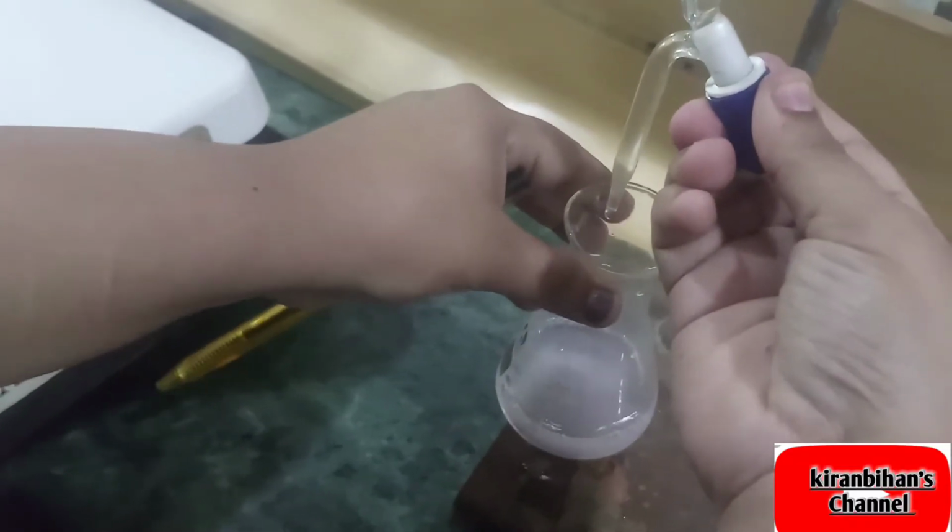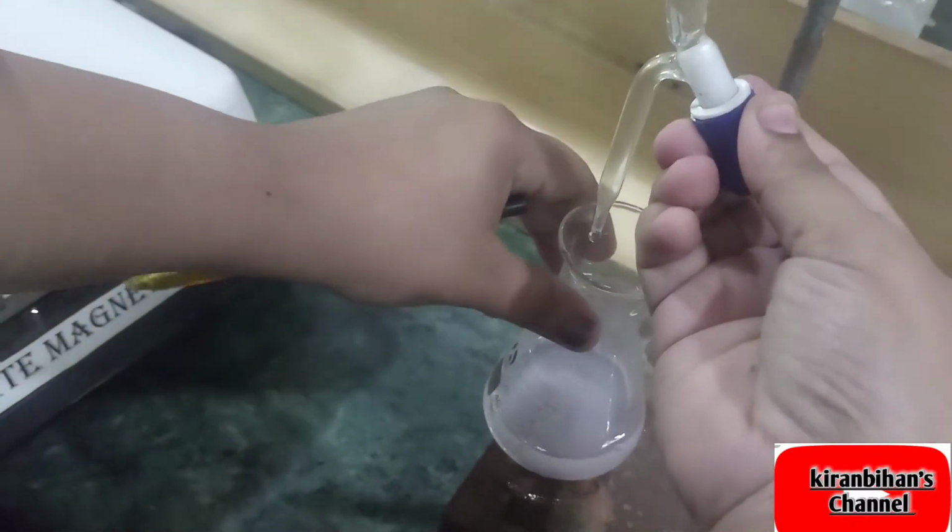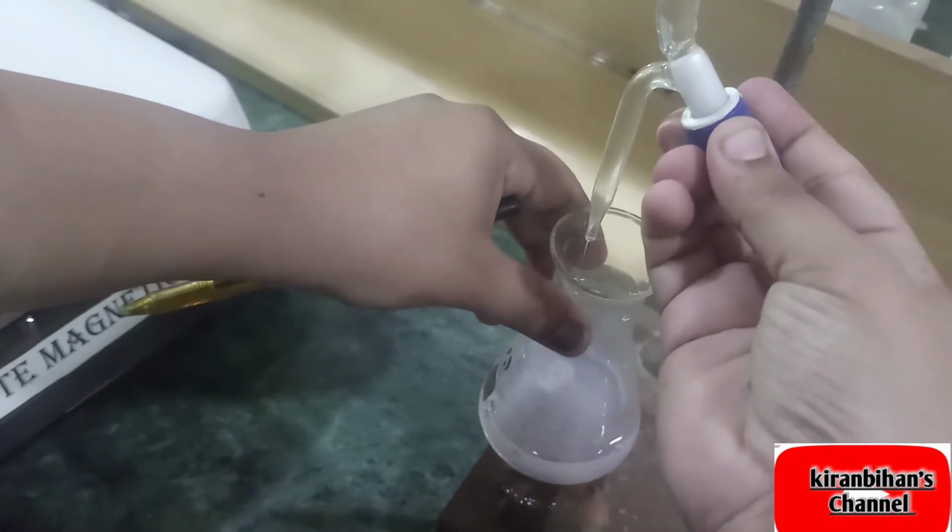We will dissolve this way, we will mix this way and wait for the pink color, which will indicate that the phenolphthalein colors the sodium hydroxide solution pink, which is the basic medium.